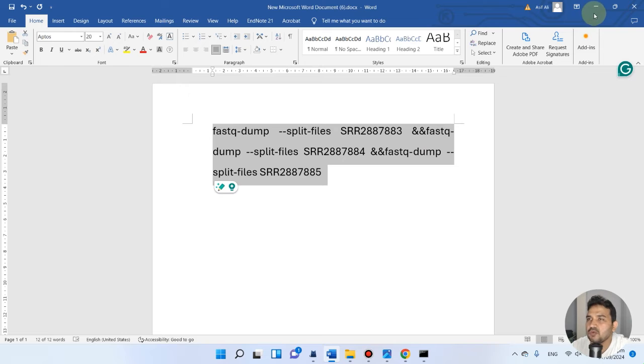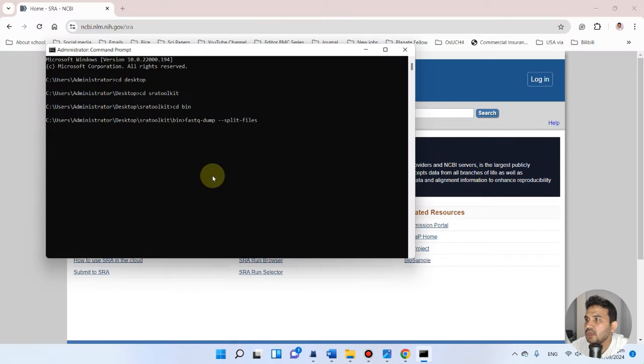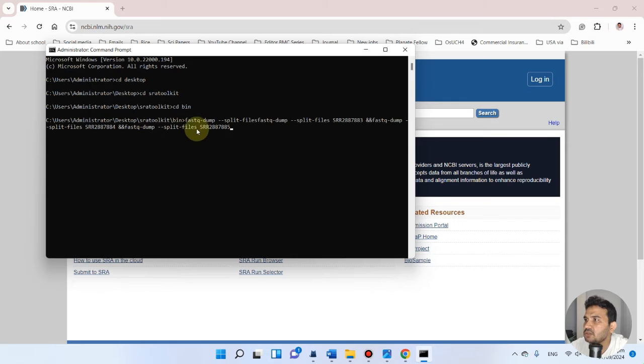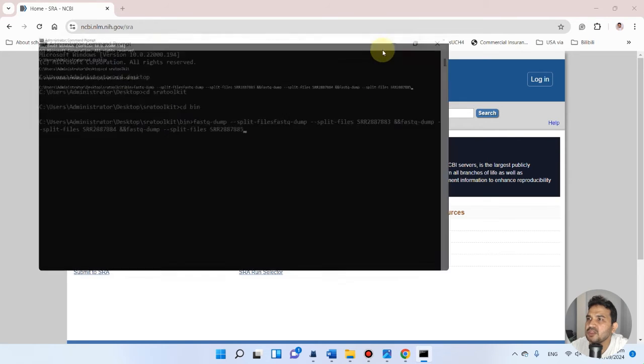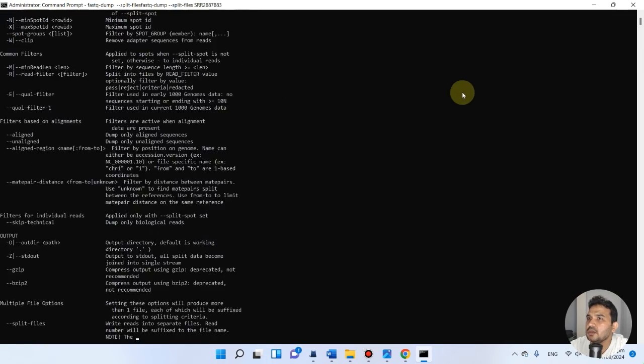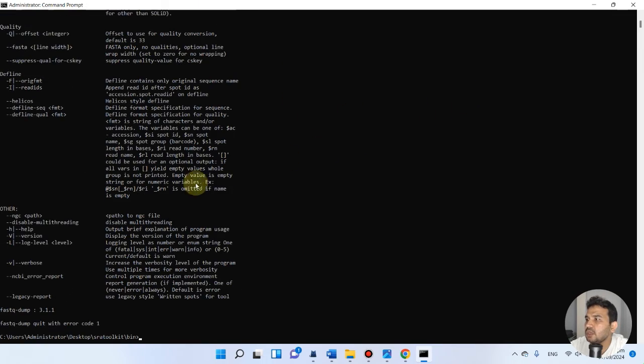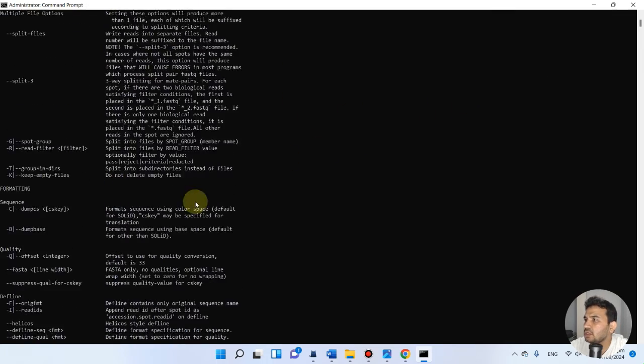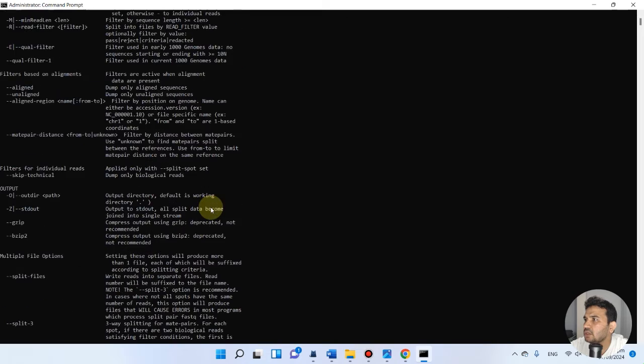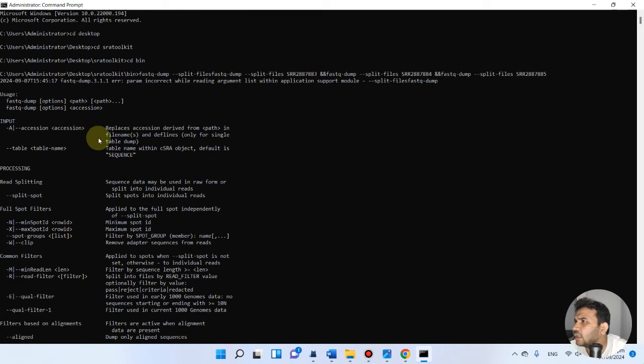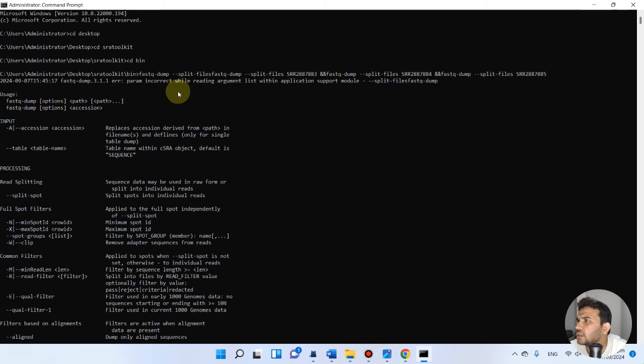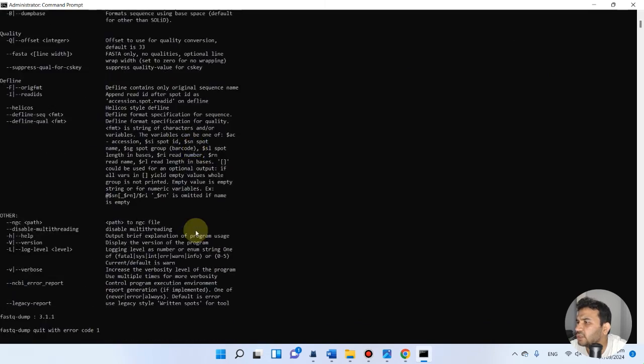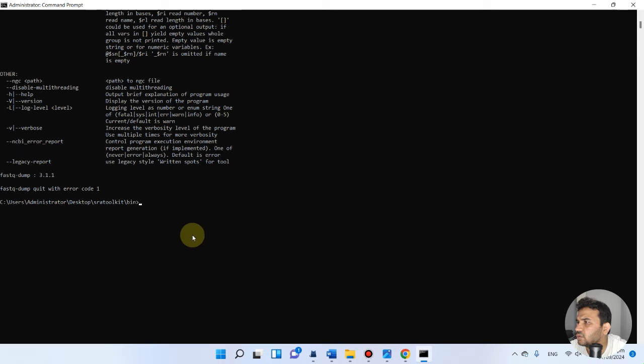Now I want to paste them here. You see here, fastq-dump - it's all pasted there. We can simply press enter. Oh sorry, there is actually one error.